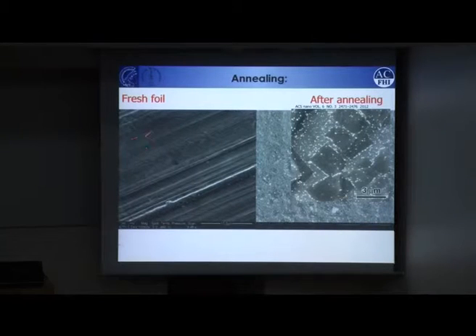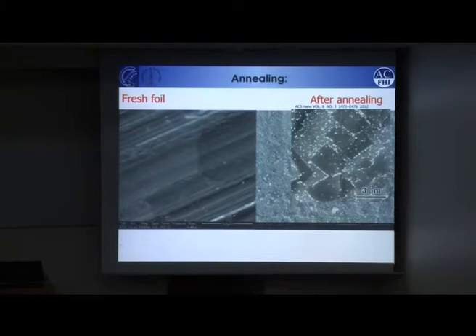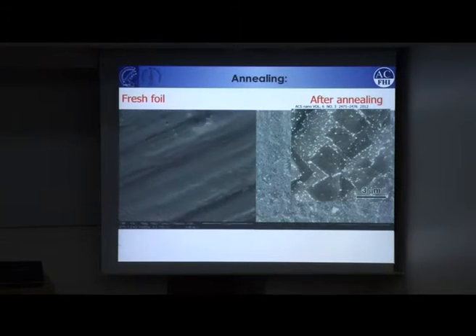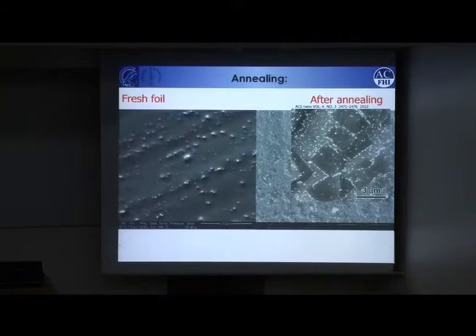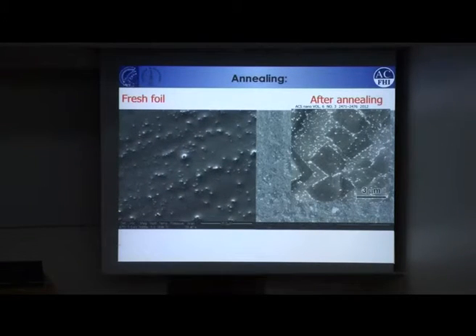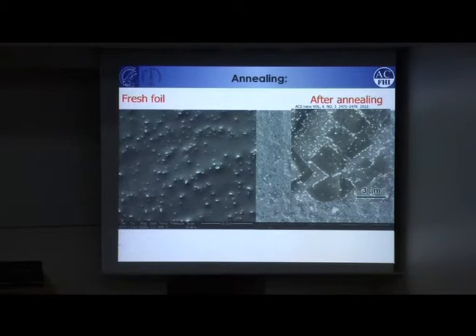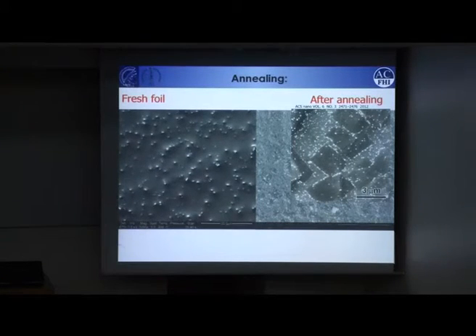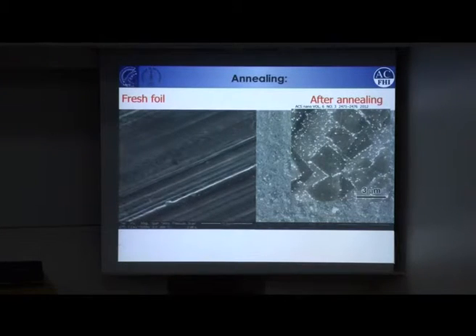And as the temperature increases, you see some grain boundaries, but above like 500 degrees these grain boundaries start to move, and you see that they move around. And we're running hydrogen at a certain temperature. At this condition you get some surface roughening. When you heat even higher, like 900 degrees, suddenly lots of white particles are visible. And you see a kind of grinding motion of these white particles on the surface. They go in different directions, bounce around, and you have the impression that the surface is a bit melted. And that's actually the conditions at which you grow graphene, 900 to 1000 degrees.